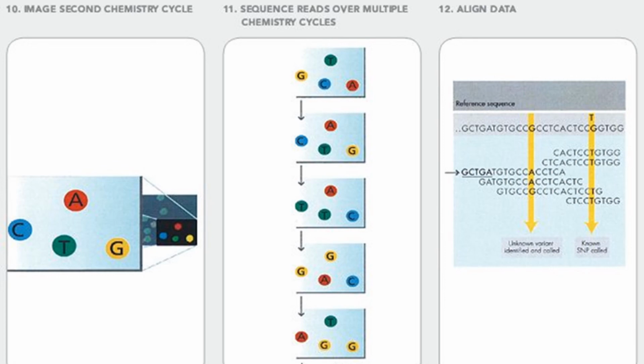Step 12. Align data. It is necessary to align data and further compare the data to a reference to identify different sequences.